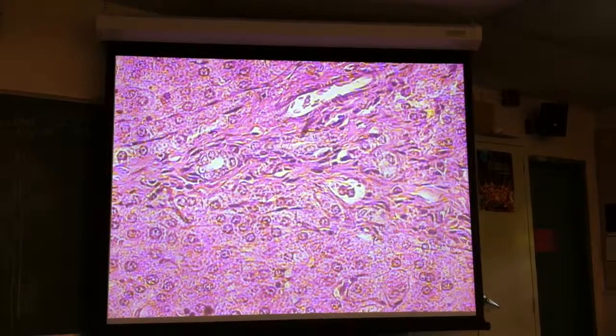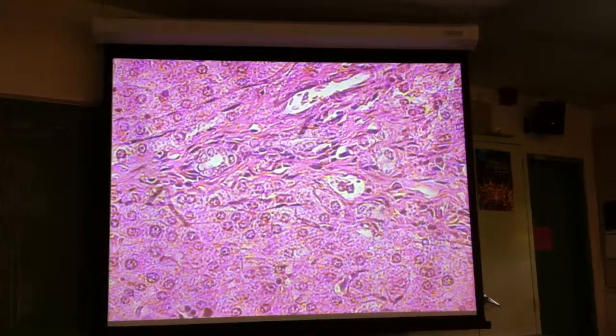Jamie, I think I have it pretty good here, and it's blue. It's the older slide. It's got a nice structure. Let me scan around a little bit more here and see if I can find another good one. Yeah, I might have all three right there.